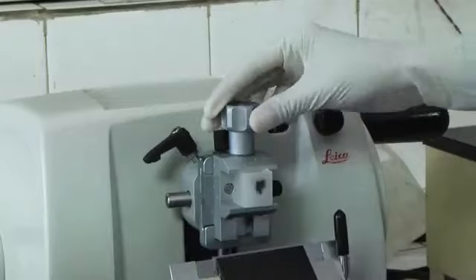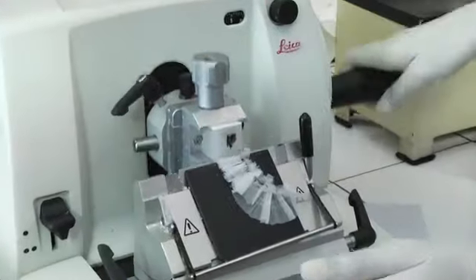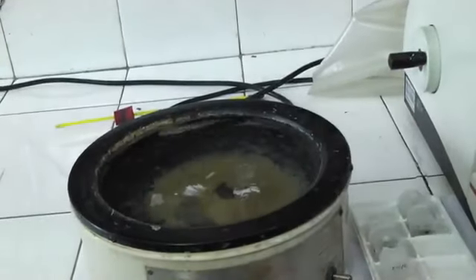After sharpening the microtome knife in the knife sharpener, each block of tissue is fitted in the microtome machine. Sections are cut at 4 to 5 micron thickness. Ribbons of good sections are selected and floated and flattened on lukewarm water in a water bath.